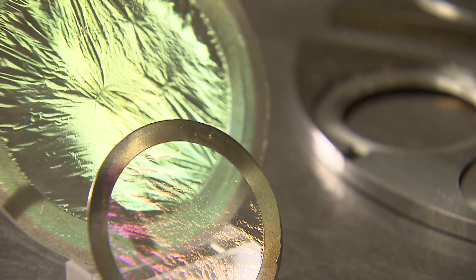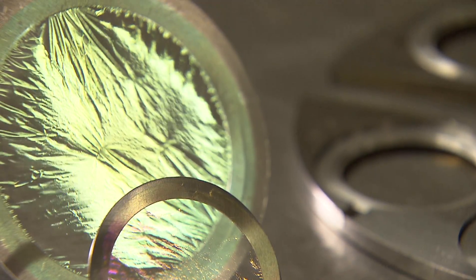We apply the same process for the preparation of thin layers of uranium, neptunium, plutonium, and americium isotopes. This production is done in the nuclear controlled area, which is equipped with evaporators, molecular plating cells, and alpha particle counters.